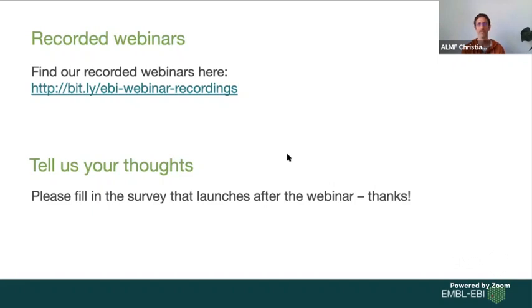So in case of doubt, I would say use something that potential readers of your science can reproduce, but otherwise Imaris, as I said, we also use it, and I think it's fantastic. So I wouldn't throw away the old license.